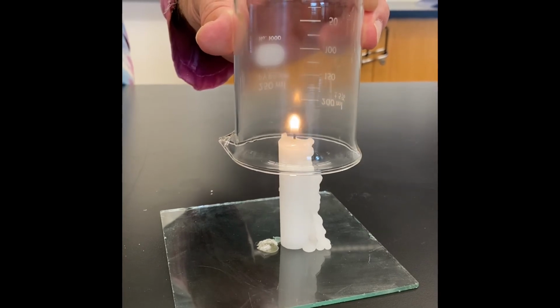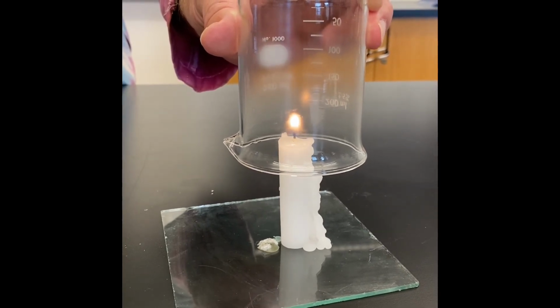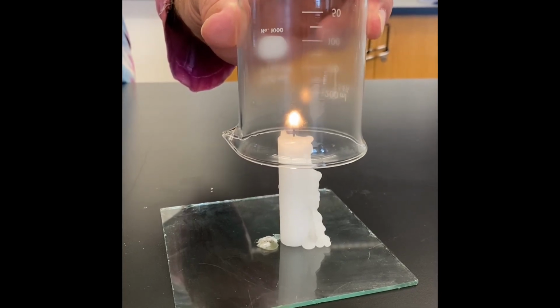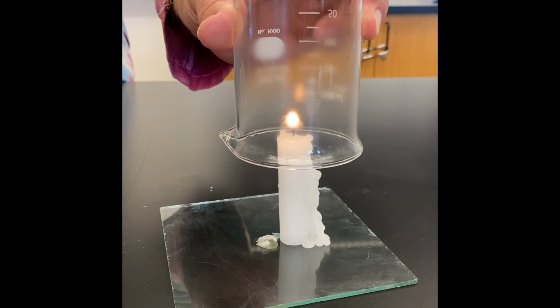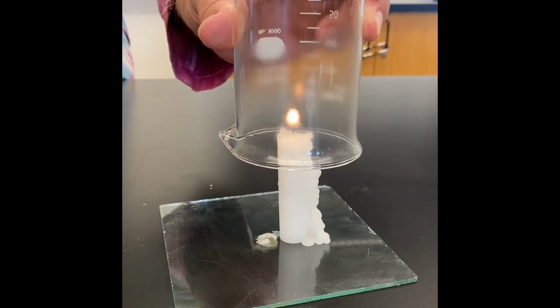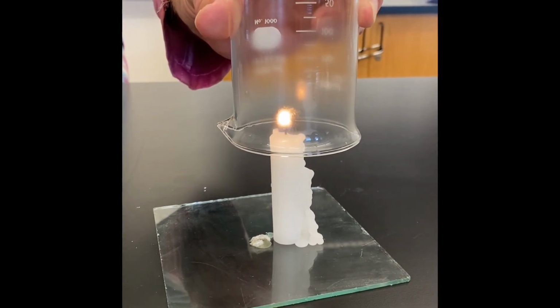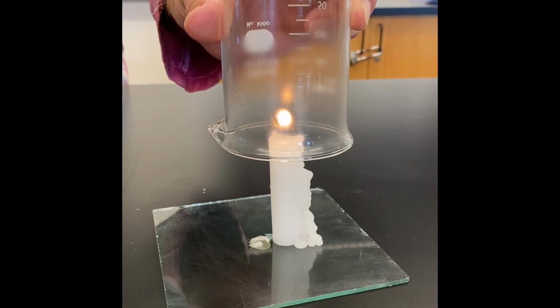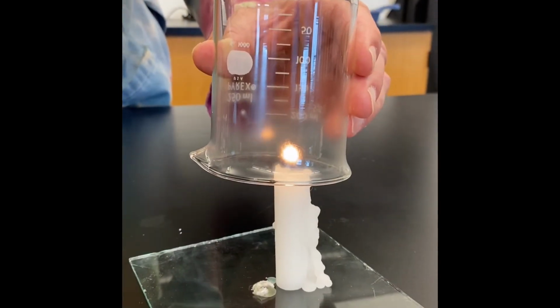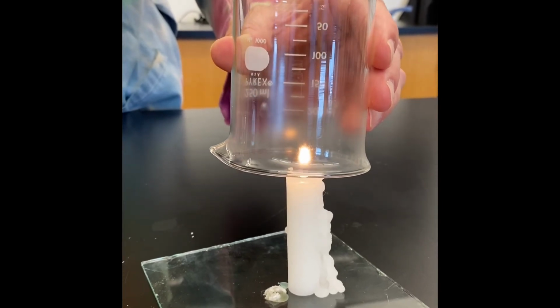Due to the fact that candles don't burn perfectly, you may notice some black soot forming on the top of the beaker, but that's not what I'm looking for. I'm looking more for something that will resemble condensation on the side of the beaker. Okay, so we have collected some material on the side of the beaker.